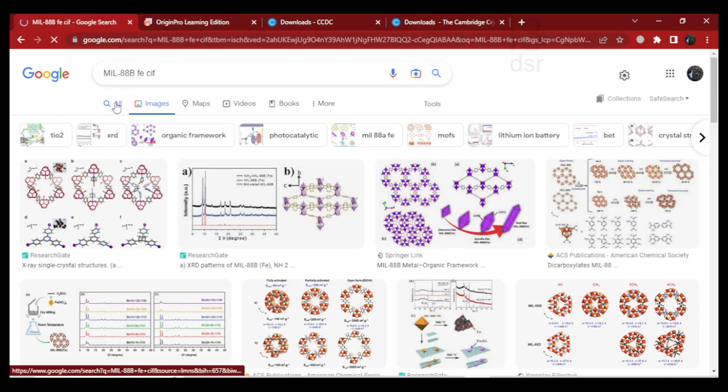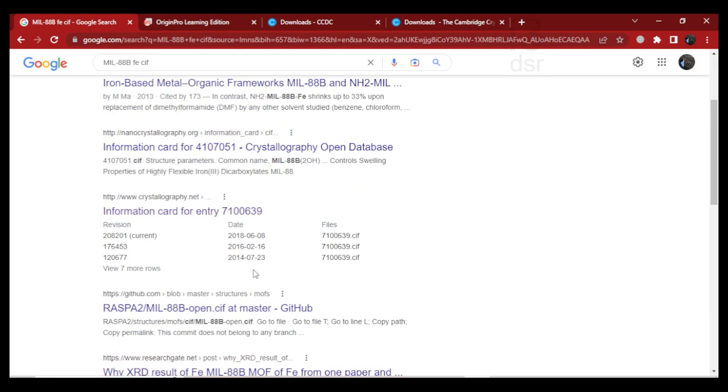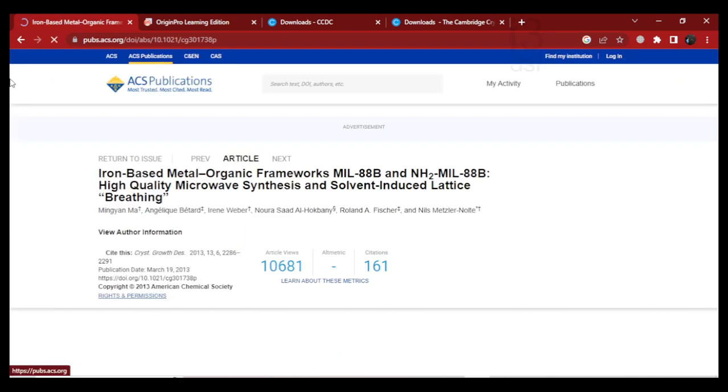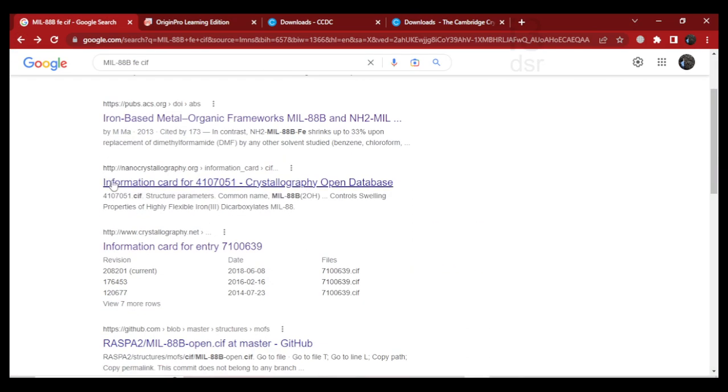Go to crystallography.net, not this nanocrystal technology. Go to this crystallography.net. Enter.